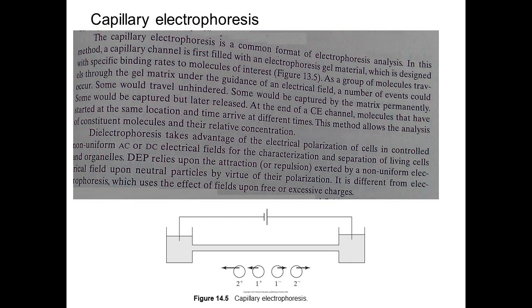Slide number 26 is about capillary electrophoresis. Capillary electrophoresis is a common format of electrophoresis analysis. In this method, a capillary channel is first filled with an electrophoresis gel material, which is designed with specific binding rates to molecules of interest.